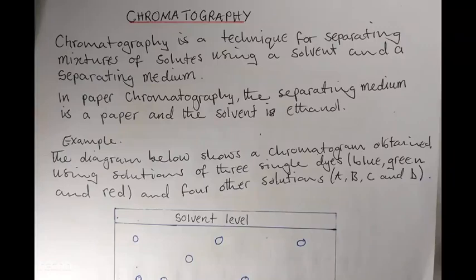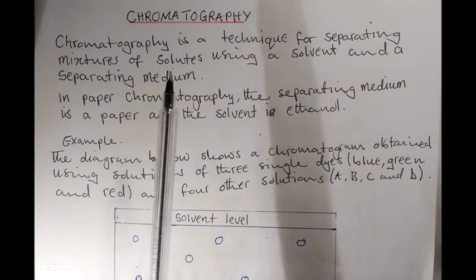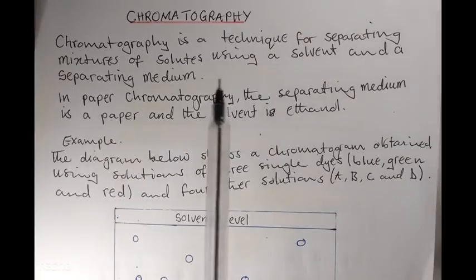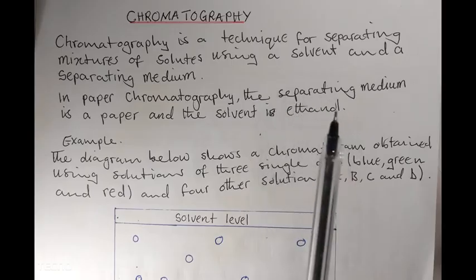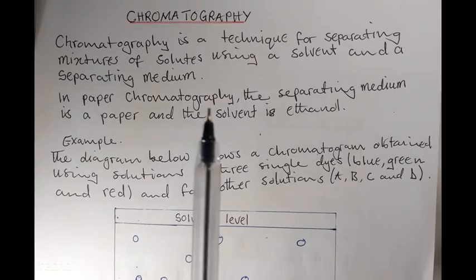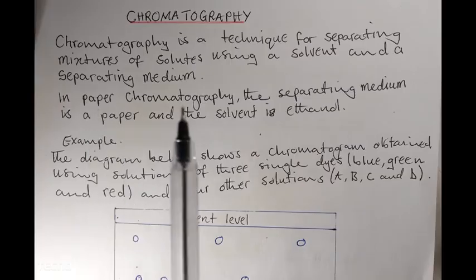Welcome to chemistry class. Here we are talking about chromatography. Chromatography is a technique for separating mixtures of solutes using a solvent and a separating medium.